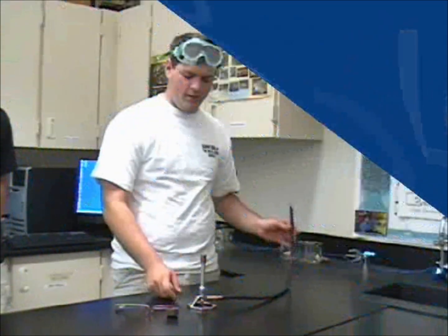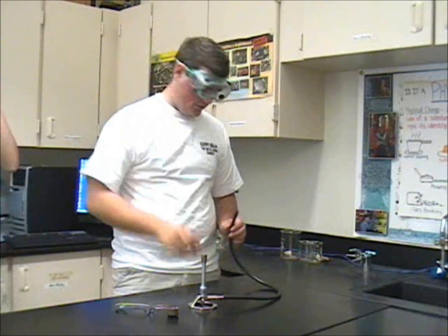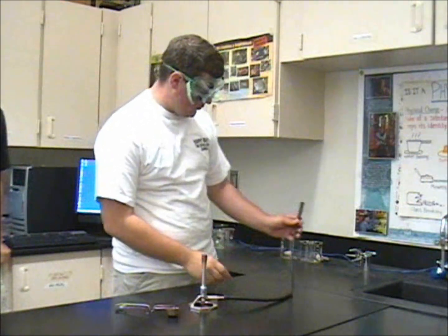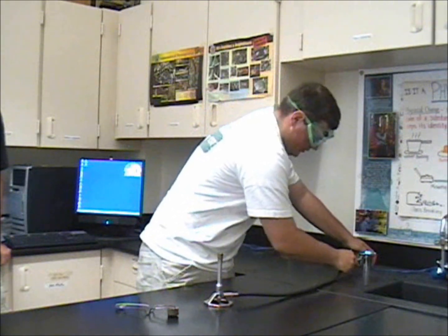I am going to tell you how to light a Bunsen burner. When always working with fire, you need your goggles, and then you need to hook this hose up to the gas outlet valve. You need to make sure it's on there snug.